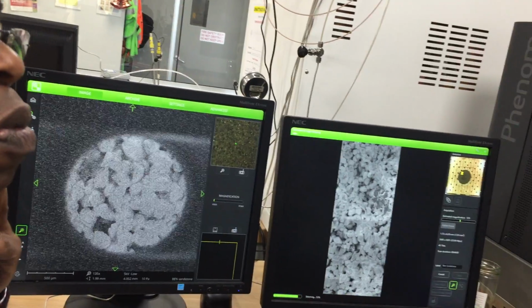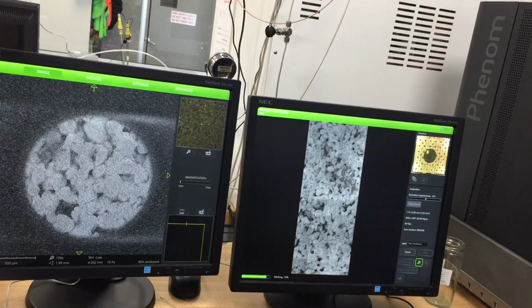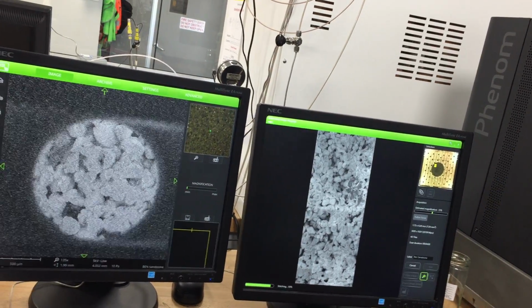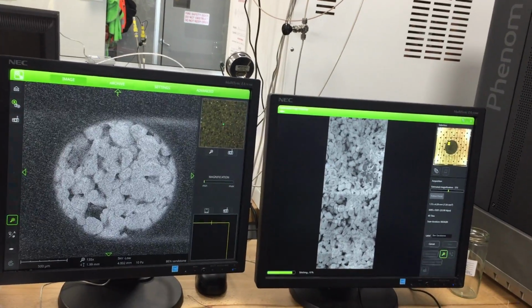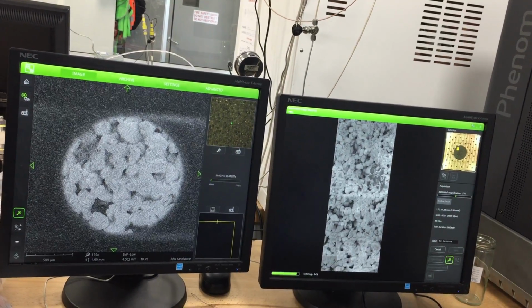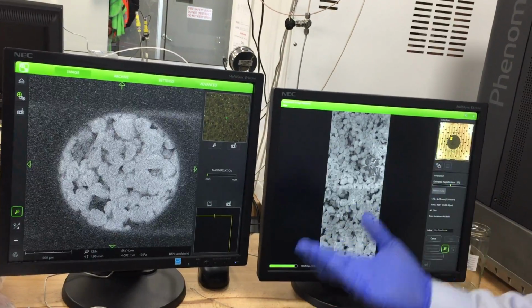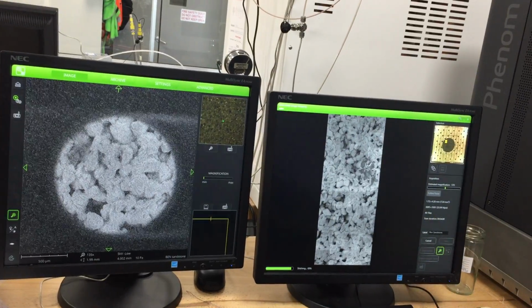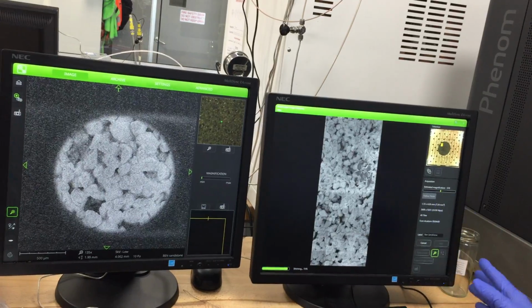You can go to an electron microscopy center and coat it with gold or platinum or something like that, and then you won't have that problem. But you cannot do EDS analysis, because if you do elemental analysis on something that is coated with platinum, what do you see? We see what you have coated with. Platinum only. So it depends what you want to achieve. If you want a non-charging sample, very high resolution, then coat it. But unfortunately, if you coat it, you cannot do EDS.